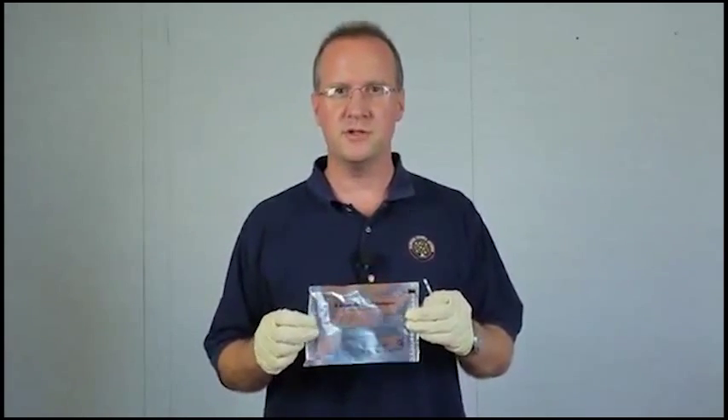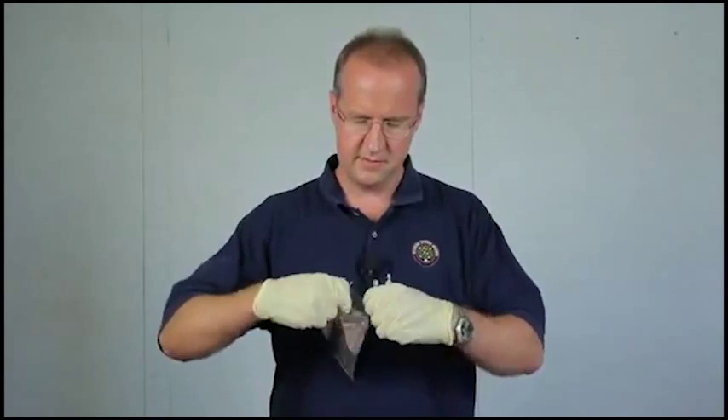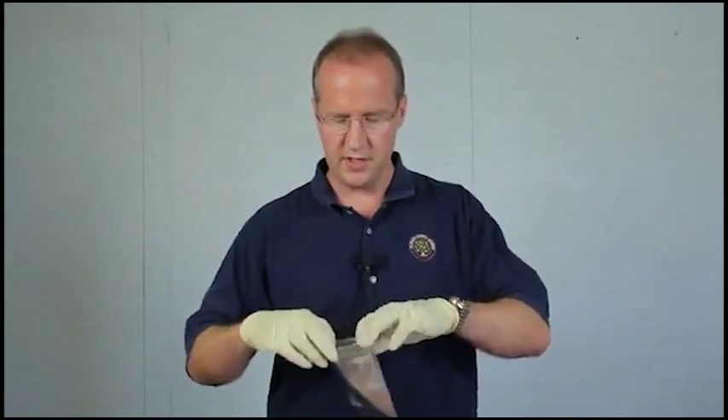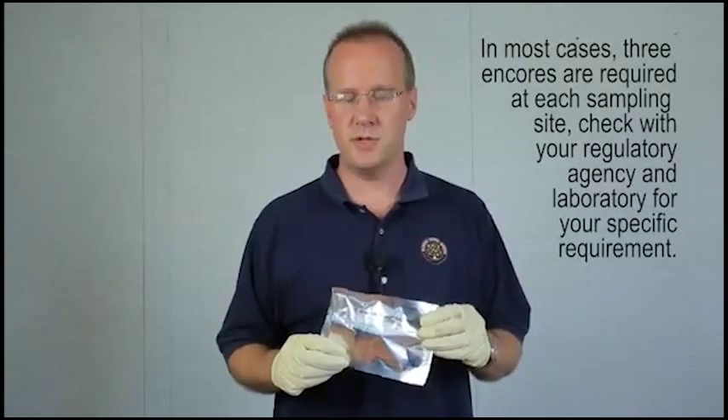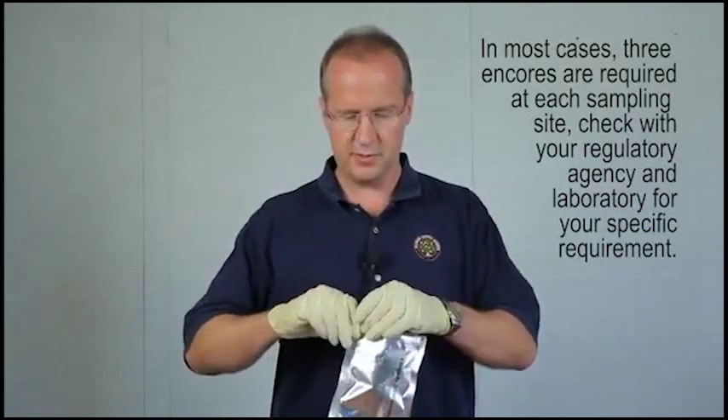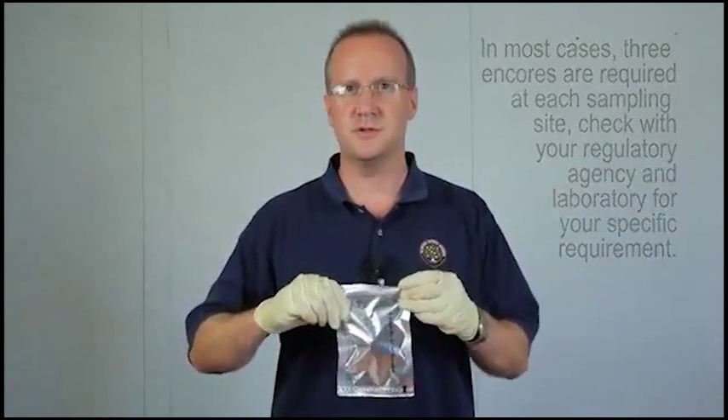Then you will have your appropriately labeled bag. Stick the sampler in the bag. If you want, you can fit three Encores into one bag, and then with a zip lock enclosure, just close it up and throw it in your cooler on ice.